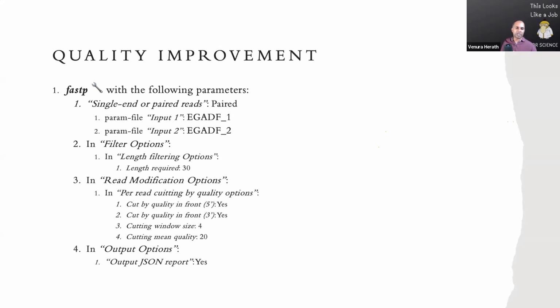Asnad, you are looking at the JSON file. You need to look at the HTML file, because the HTML file will have a very nice output. The JSON file is for a different purpose. You don't need that to answer this question. So go ahead and check your HTML file.